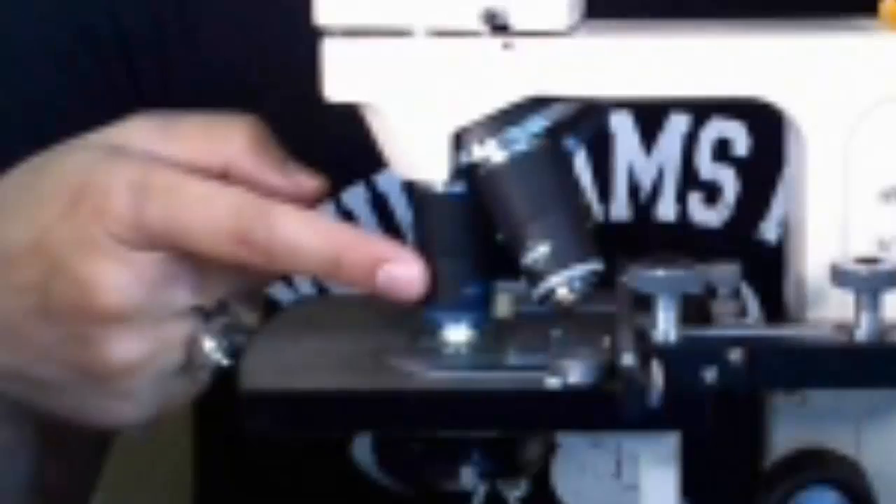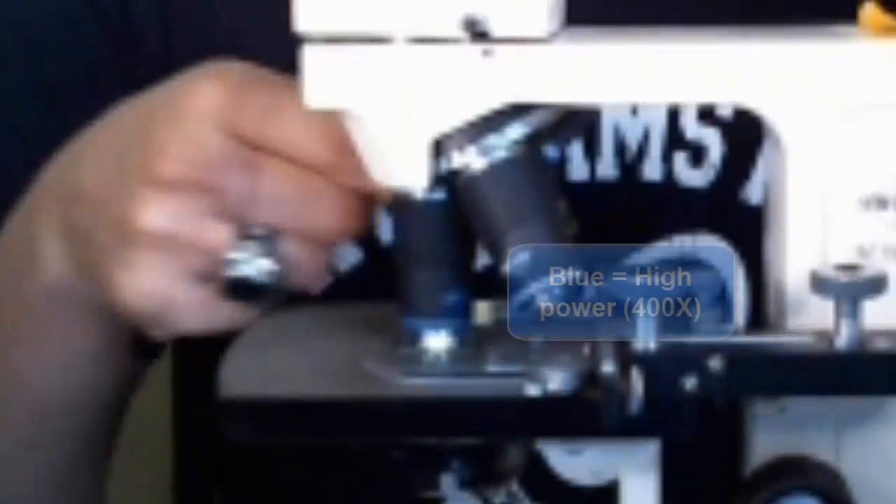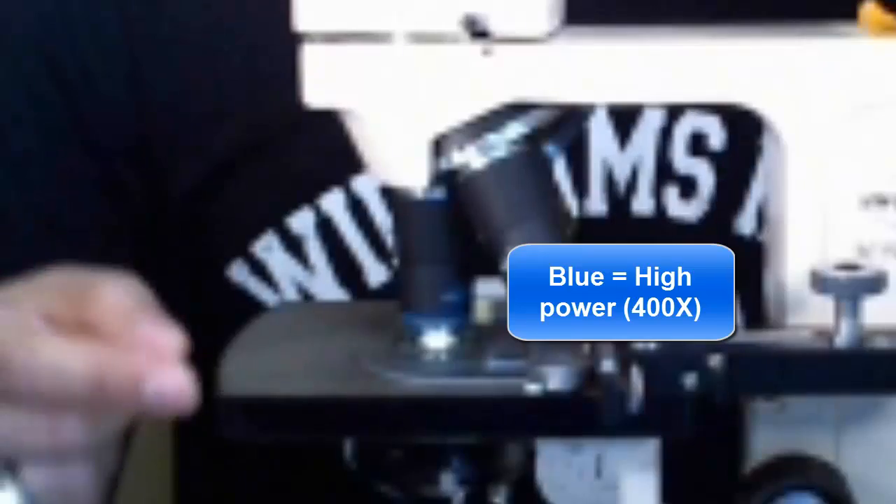The blue objective is the high power objective, and it has a 40x magnification on its own. That means whatever you're looking at is 40 times larger just with this objective lens. Then factoring in the eyepiece, you're taking the 40x image and multiplying by 10, so what you see under the blue objective is actually 400 times larger than normal. So the yellow is low power at 100x, and the blue is high power at 400x — these are the two magnifications used most of the time in biology.